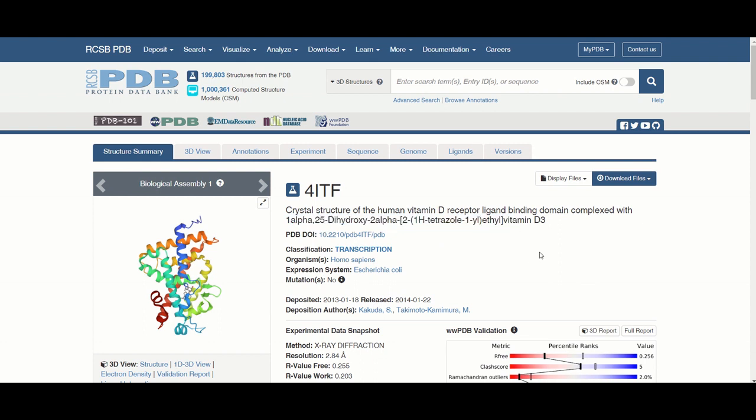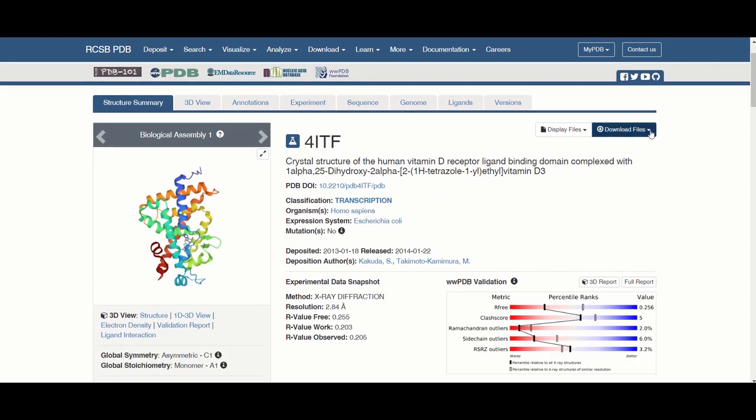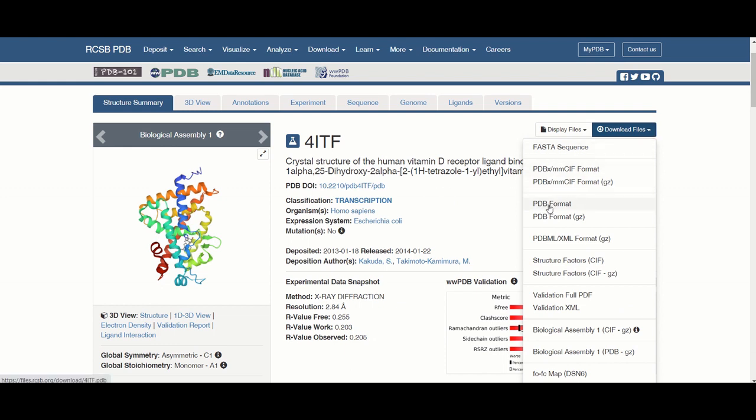So once you find the receptor that you want to download, you go to download files, then download the PDB format.